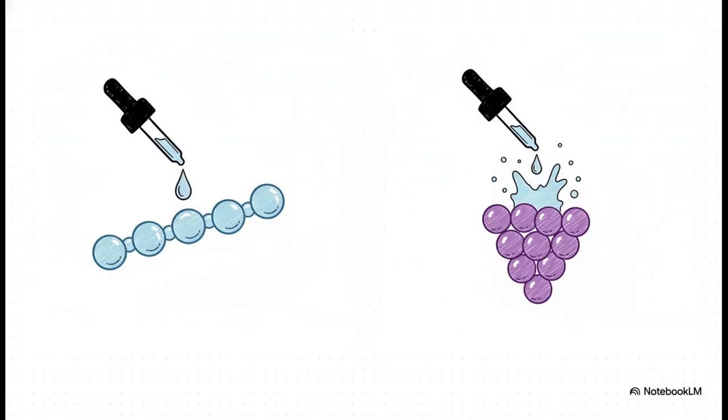Now, what's really fascinating here is how a simple negative enzyme test and a basic physical shape give us our very first forensic clue to separate two famous bacterial cousins. Under a Gram-stain, both Streptococcus and Staphylococcus show up as gram-positive spheres, or what we call coccus. But check out the difference. Streptococcus divides in a single plane, so it forms these distinct long chains. Staphylococcus, on the other hand, forms these cluster-like shapes.